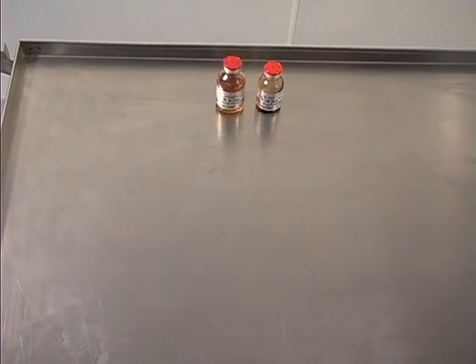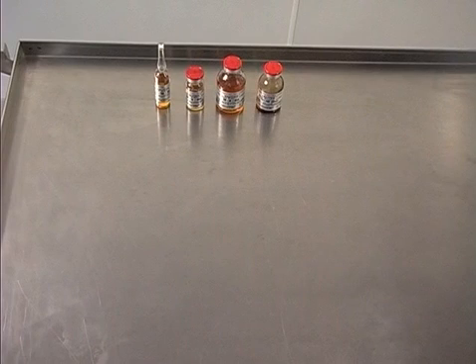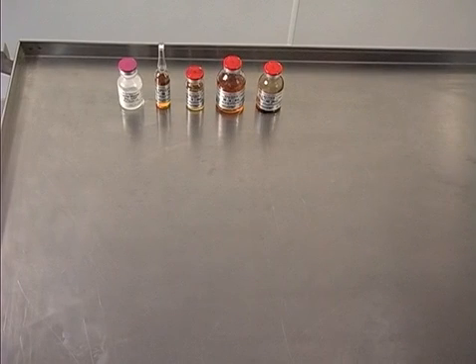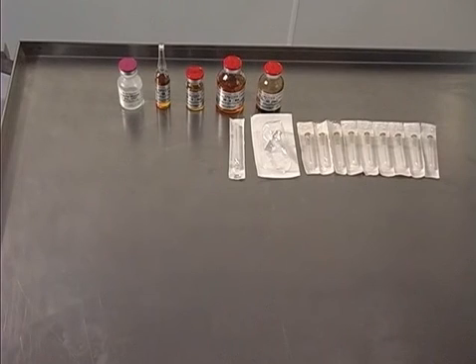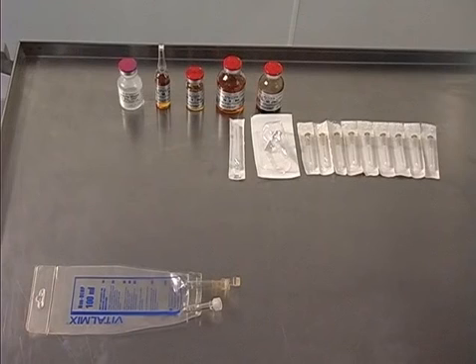The VM30, a 30-ml vial of sterile tryptic soy broth. The VM10, a 10-ml vial of sterile tryptic soy broth. And the VM10A, a 10-ml ampoule of sterile tryptic soy broth. Two 10-ml vials or one 20-ml vial of sterile water for injection. A filter needle. A hydrophilic dispensing pen. And nine 18- or higher gauge needles.